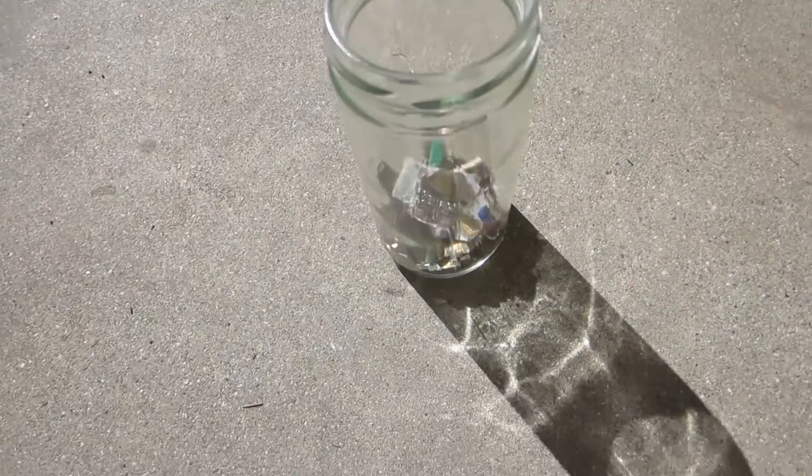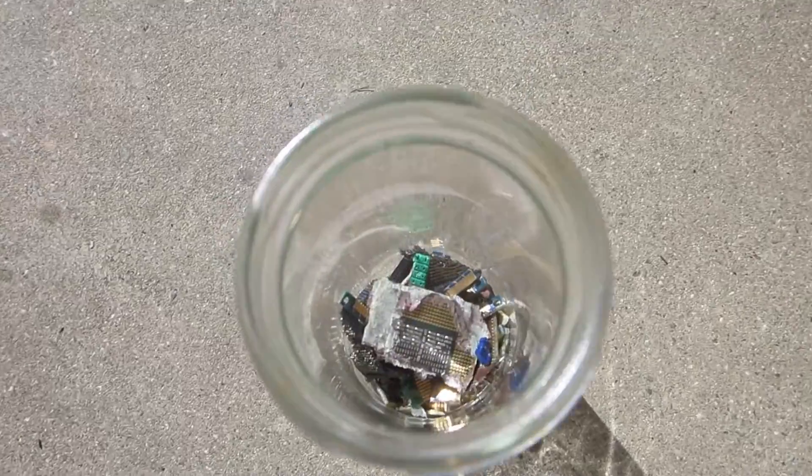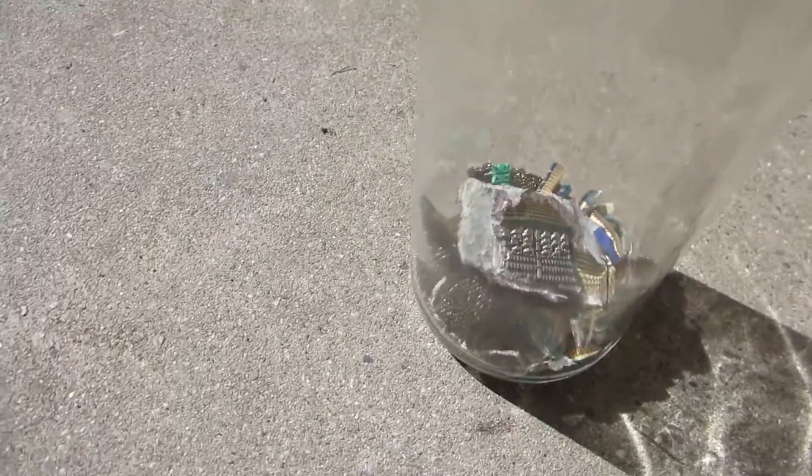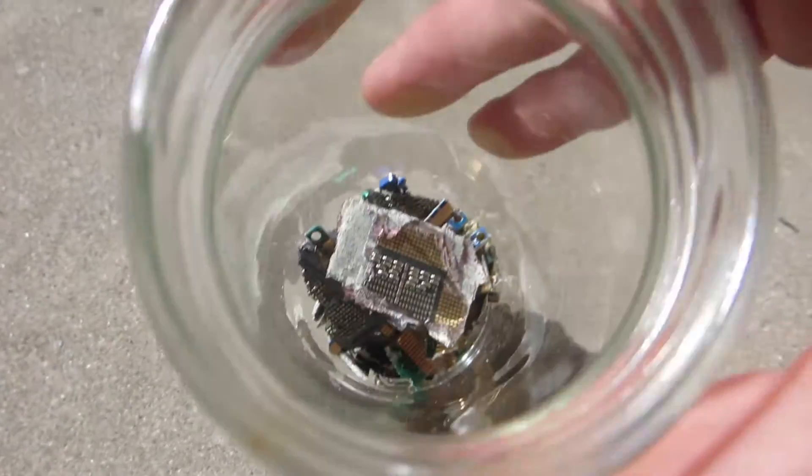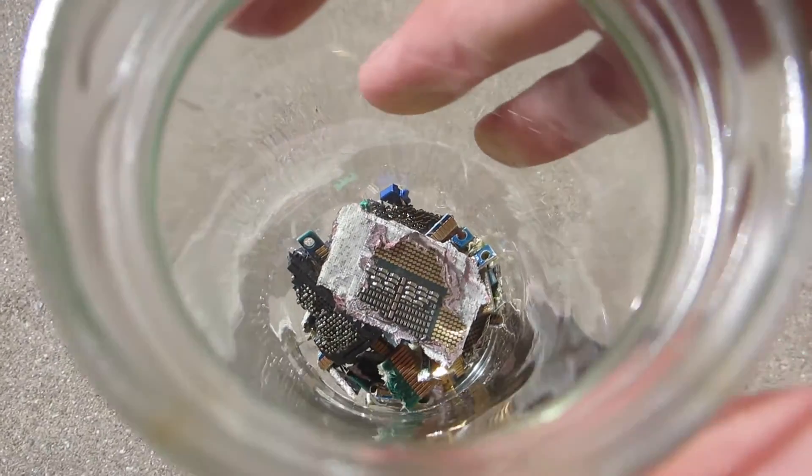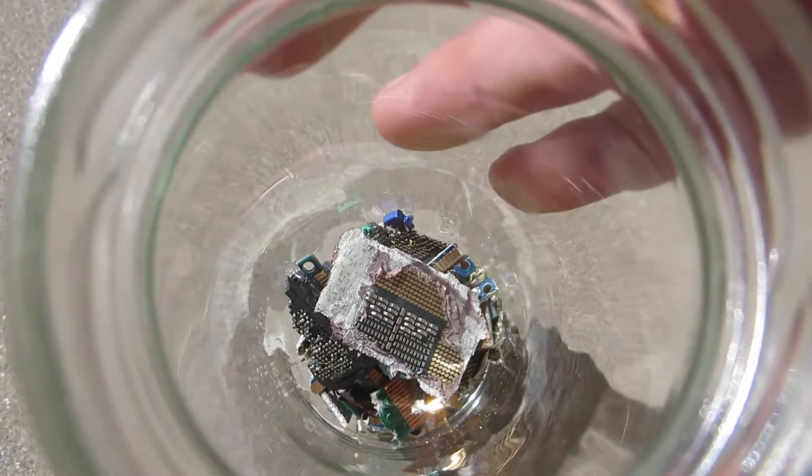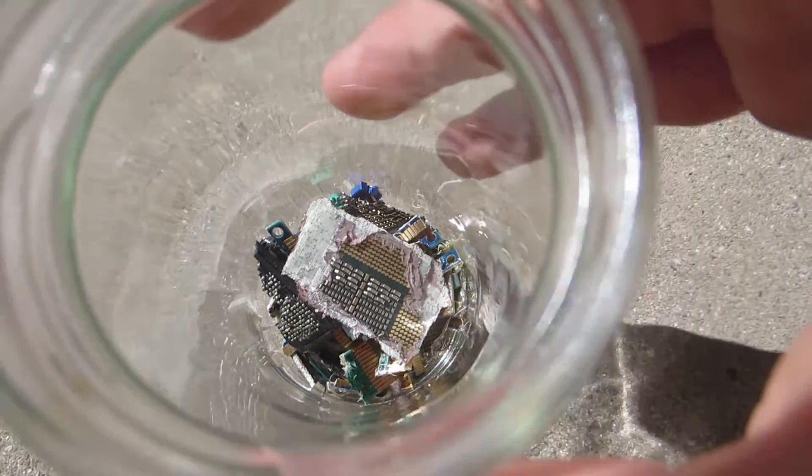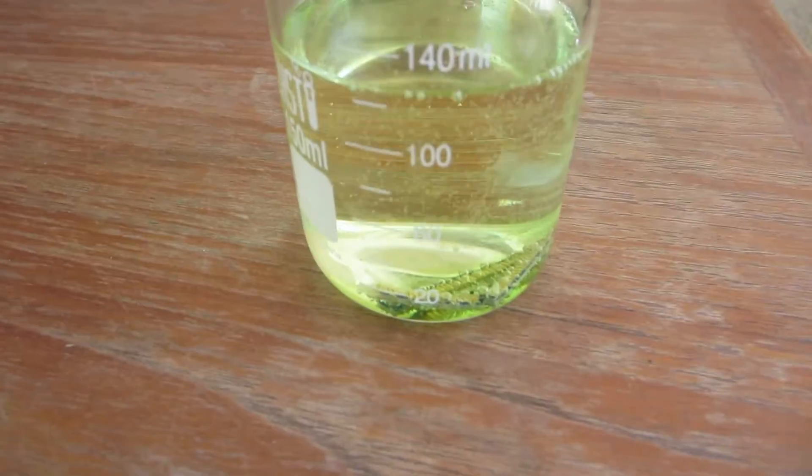We're going to extract gold from computer chips. Here are the gold-containing chips found so far. We're going to dissolve the copper in a mixture of hydrochloric acid and hydrogen peroxide.